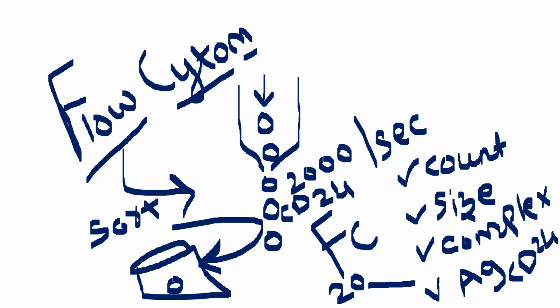This has a very important application in the field of fertility centers, because I want to take the best sperm out of my donor, the sperm that has a high chance of getting pregnancy.